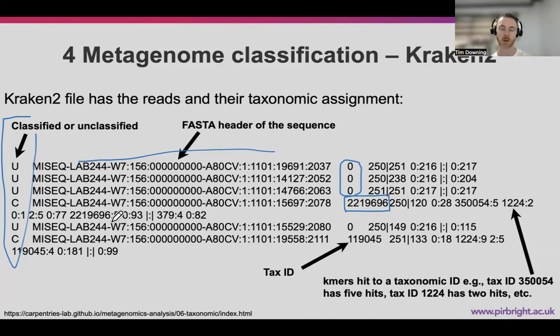Those names will be associated with a number of hits, such as 5 here, or if we look at this one down here for this taxonomic ID, we can see that we have 4 hits for this one. So that'll be the kind of output we get. It's worth looking through your file to see what you get for your different matches, and that'll help you solve this puzzle of what potential viral agent is affecting these dolphins.